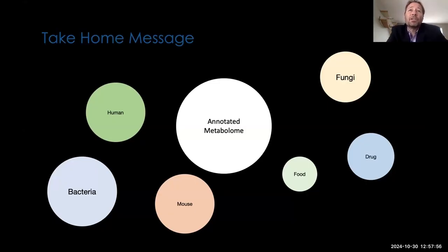So when you do co-analysis of the food and the clinical samples, we took a brute force approach, and we initially primarily focused on what was only identical. However, Chase is right in the fact that a lot of these metabolites undergo metabolism. And so one of the things that we have done, but we haven't done routinely, is in the molecular networking, you can look for analogs of these metabolites and also assign those to belong to those particular food categories.